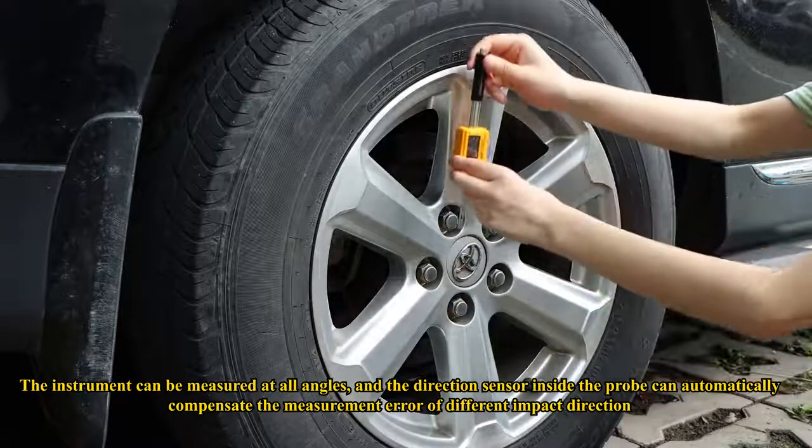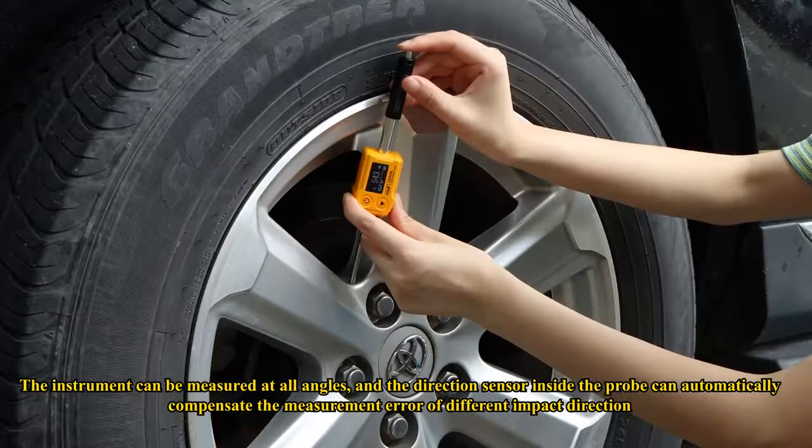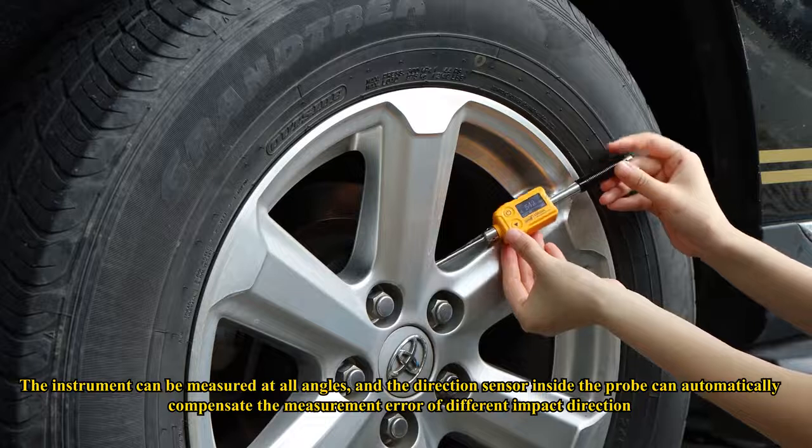The instrument can measure at all angles, and the direction sensor inside the probe can automatically compensate the measurement error of different impact directions.